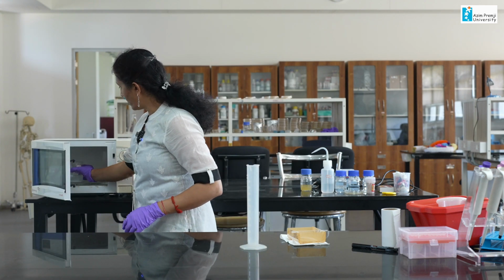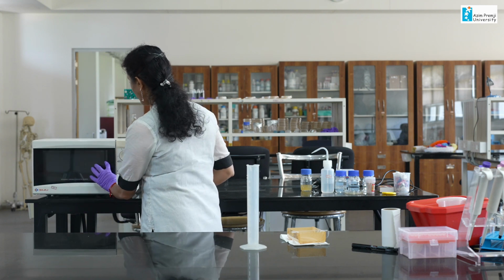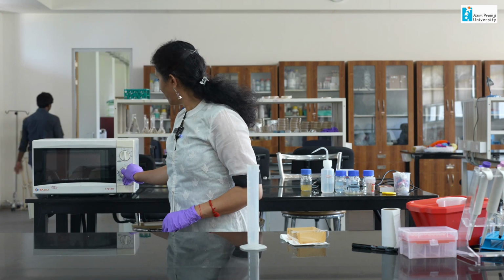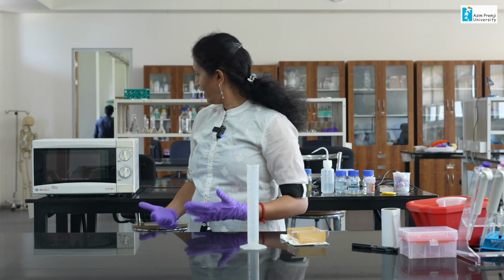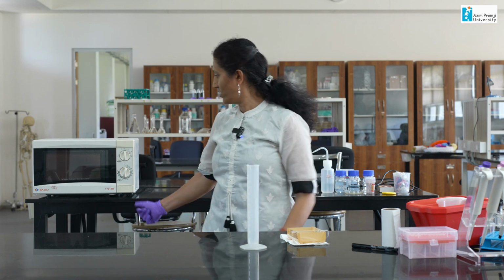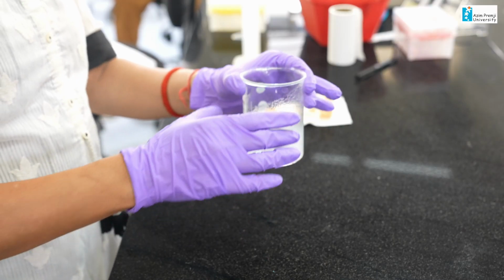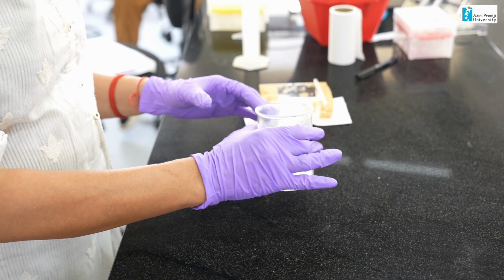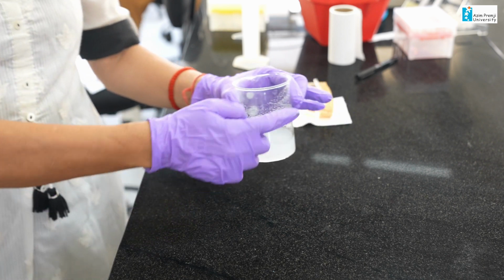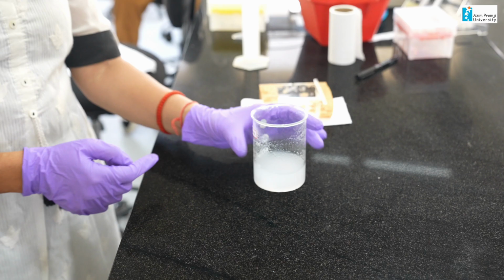So, I am going to keep it in the microwave oven and then turn it on. You have to keep watching, it should not spill. When it starts boiling, it actually comes up and then spills, so you should be very careful while doing it. Now you can see as it starts boiling, the agarose starts melting and it becomes clearer and clearer, but I can still see the crystals here. So, I am going to keep it back.